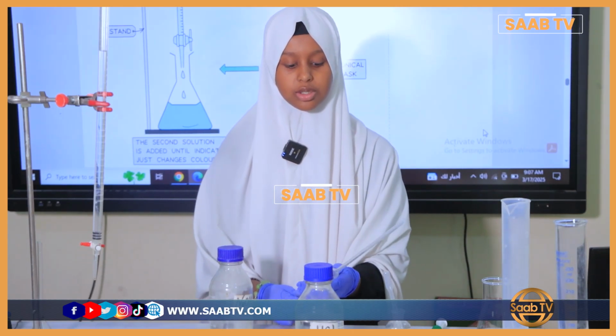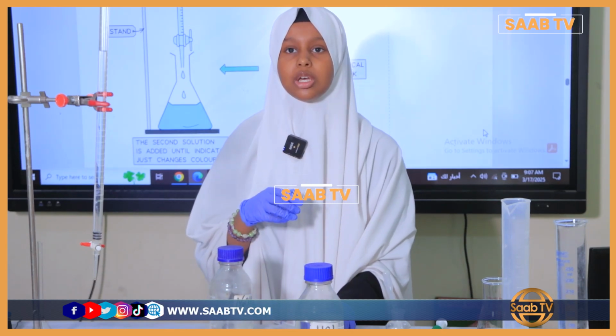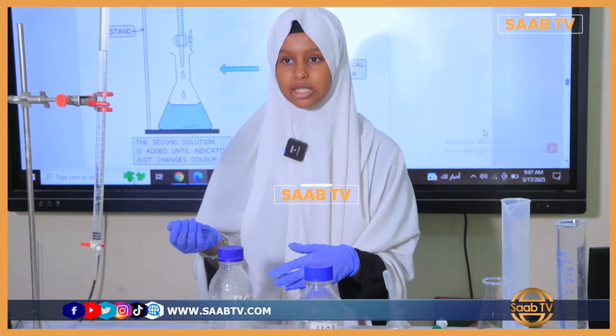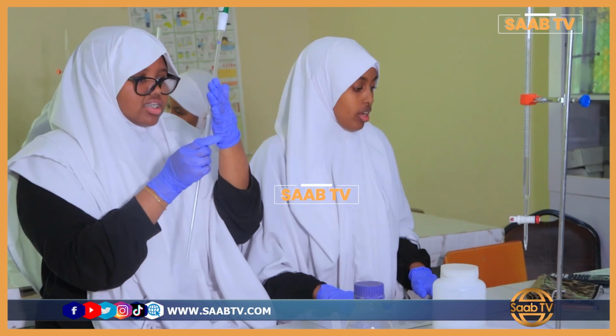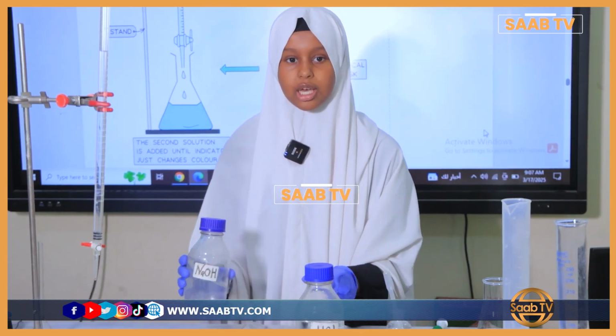Today I'm going to be doing the 3rd test of titration so we can see if we have concordant results. The aim of titration is to find out the amount of acid needed to neutralize the base, or the amount of alkali you need to neutralize the acid. For the alkali, we have sodium hydroxide, and for the acid, we have hydrochloric acid.